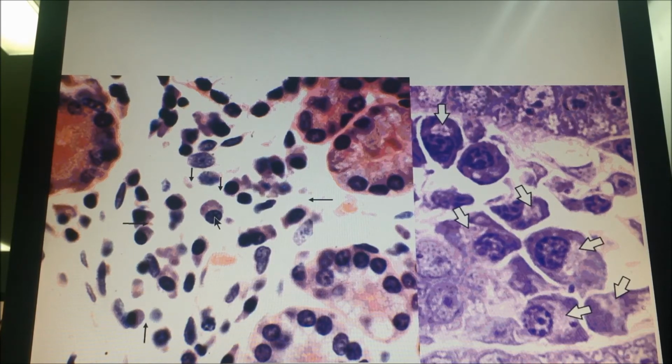Correct? Above the nucleus in the cytoplasm there is a slightly lighter area, a clear area. The clear zone contains a large amount of Golgi, juxtanuclear Golgi or supranuclear Golgi. The Golgi doesn't stain with hematoxylin and eosin, so this is its negative image on the section, above the nucleus, the clear area. The remaining cytoplasm stains basophilic because it contains large amounts of RER.